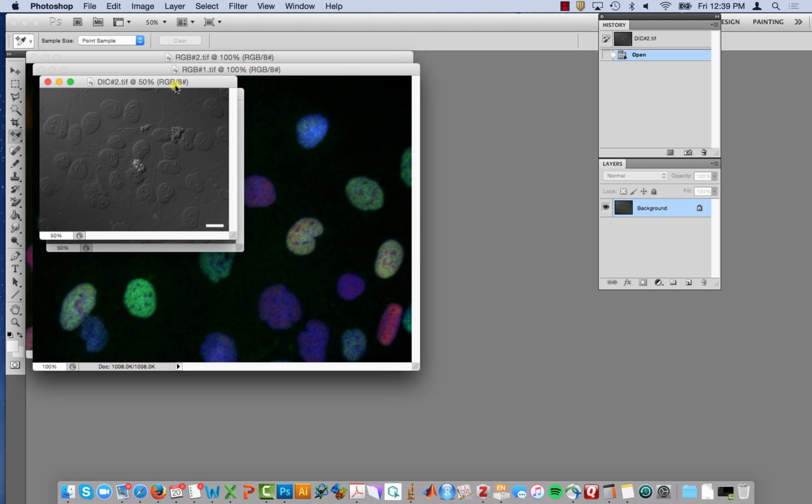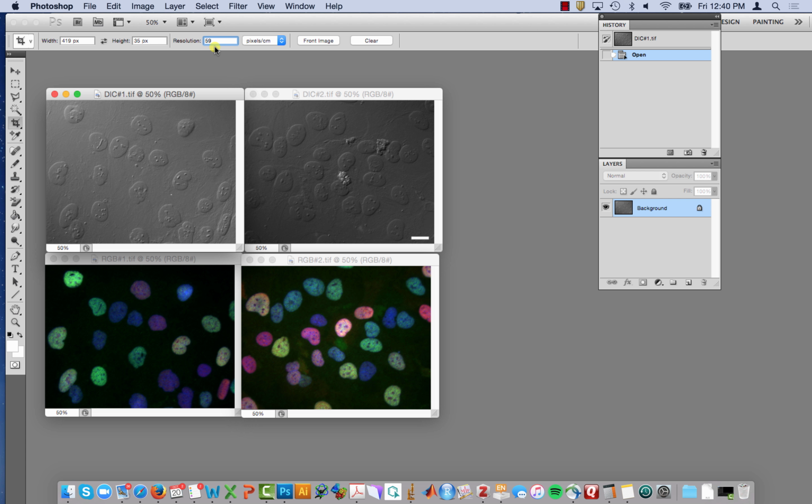Now there are different tools. There's a cropping tool over here, but I would recommend not using this for this type of cropping that we want to do if we wanted to make it square. And the reason is that it will resize the image based upon whatever is set up here, and that resizing can create or destroy pixels using the cropping tool. And so the way that we crop to not create or destroy information is by simply changing the canvas size.